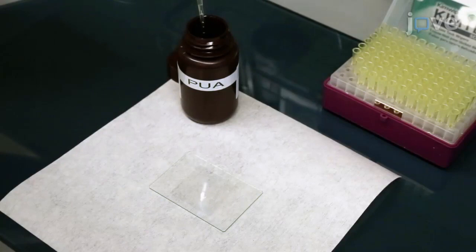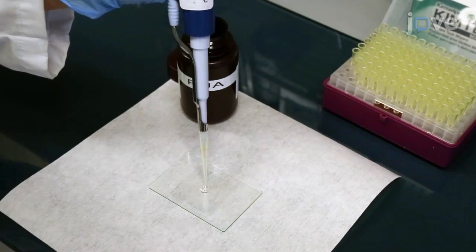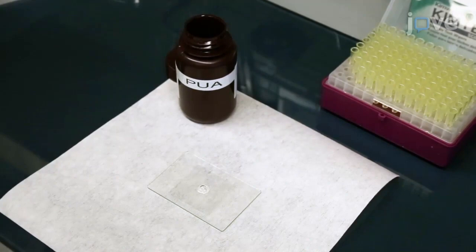Add a 0.1 milliliter drop of UV curable polyurethane acrylate type resin with a viscosity of 257.4 cps on the surface.